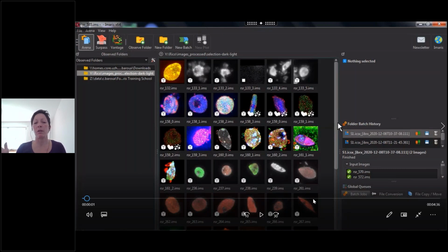And then the domain organization would be more if your protein is a free-living species and sometimes creates very large clusters, very large domains, which are rather in the interior of the nucleus, and maybe small domains at the periphery.